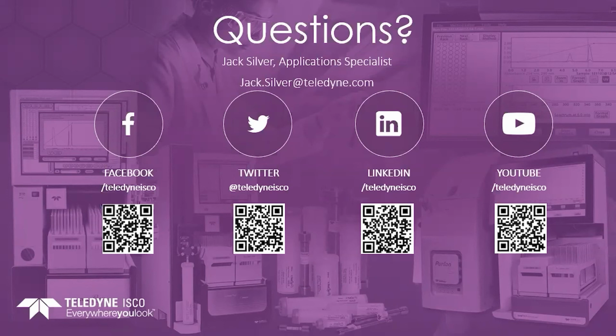The next question is, can the system be configured for both manual and auto injection without the need to replumb between different types of injection? The replumbing is actually very, very simple. You just unscrew the sample probe and screw in an adapter for a syringe. So you can do manual injection with very minimal plumbing change. When you tell it the injection type in the run requirement screen, you just tell it that you are doing a manual injection. So there's not much replumbing, but you don't have to take everything apart. You just replace one fitting on the injection valve.